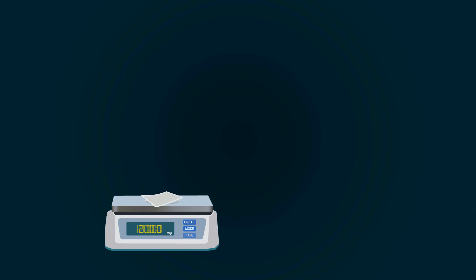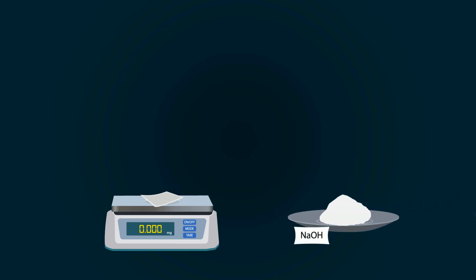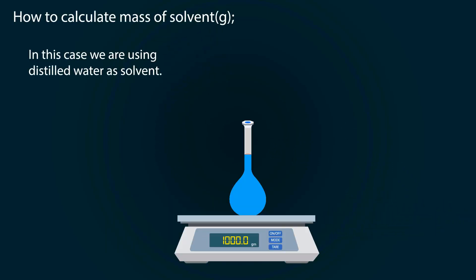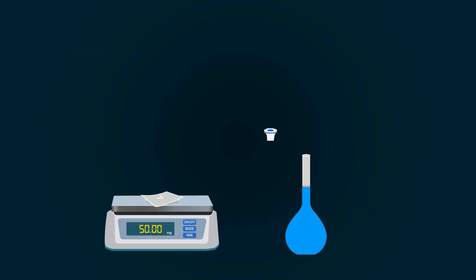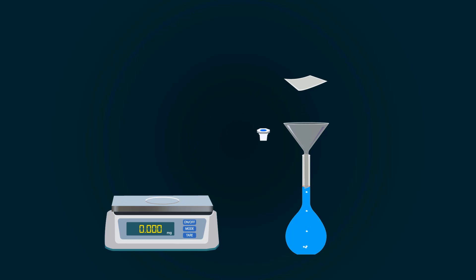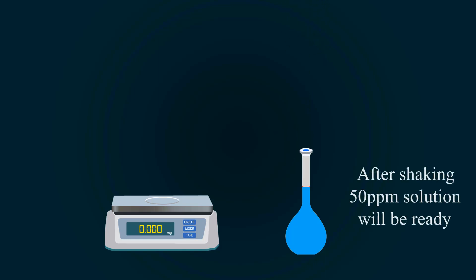Let's start the preparation. Take a weight balance and power it on. Put weighing paper on it and tare it down. Start adding solute into the weighing paper with the help of a spatula. Measure the solute up to 50 milligrams. Now add this 50 milligrams of solute into the distilled water in the volumetric flask using a funnel. After adding the solute, shake the volumetric flask and you will get a 50 ppm solution.